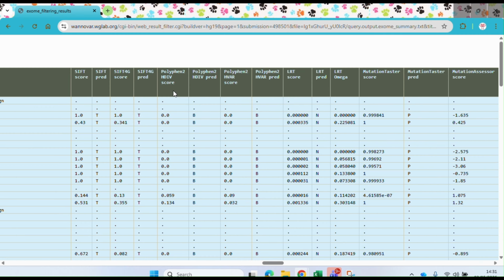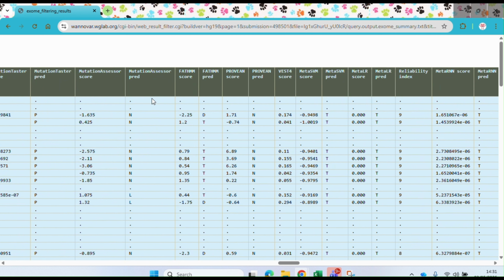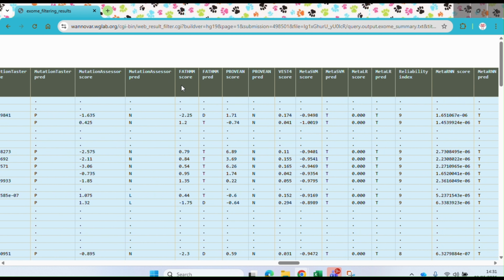Okay, so the other information ANNOVAR will give you is the pathogenic scoring. For example, in different studies, you might have seen the pathogenic scoring. Pathogenic scoring means how this variant is impacting protein function. So for that, different machine learning scoring has been used, but I haven't used these scoring in my study. The popular ones are SIFT score, PolyPhen, and another, MutationTaster, you might have seen in some studies. The scoring I have used is FATHMM scoring. This scoring has outperformed the other scoring tools, so that's why I started using it.